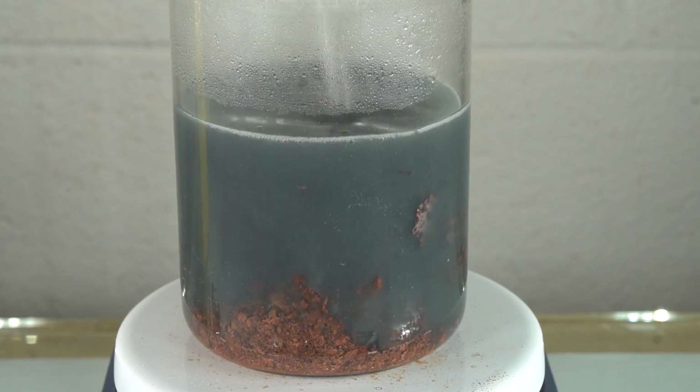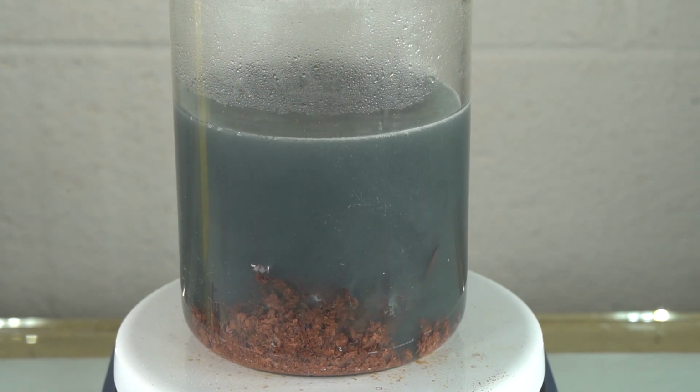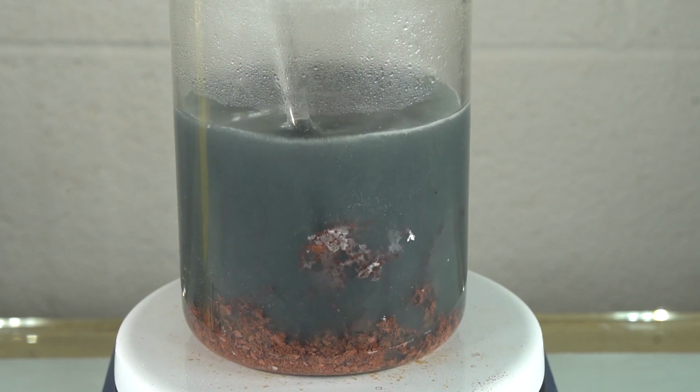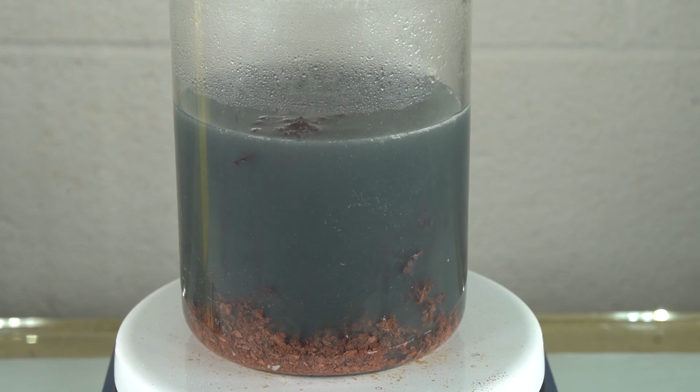And I've done this experiment many times. Normally the aluminum stays floating at the surface, and this time the aluminum seems to be not floating, so that's okay. But we're going to let this run for a few more minutes until all the aluminum is gone and the solution is clear, which means all the copper has been reacted with, which is what we really want. We want to convert all of the copper ions in the solution to copper.